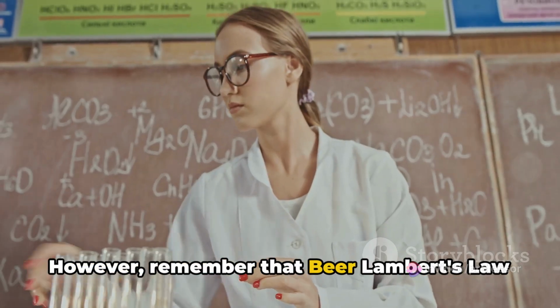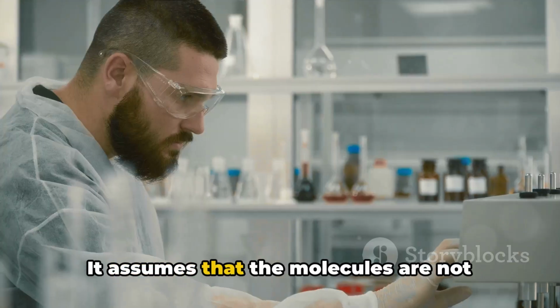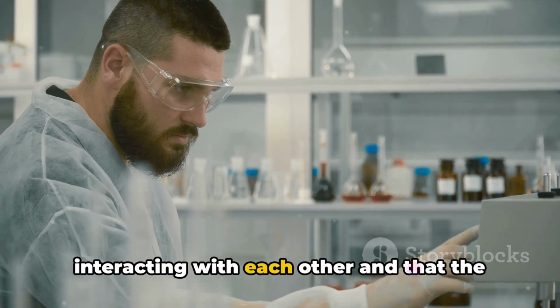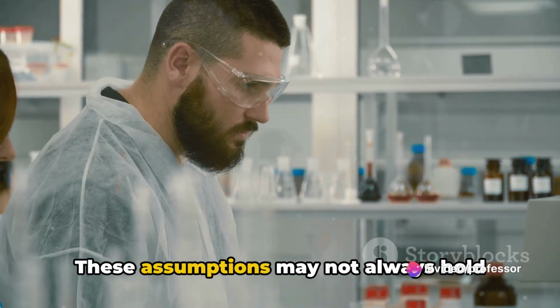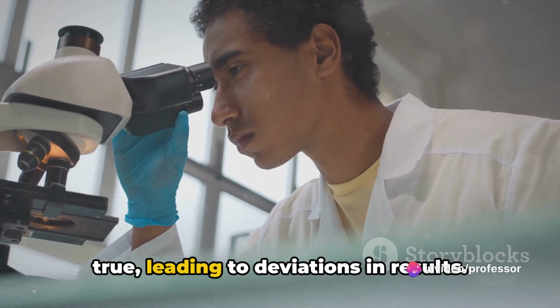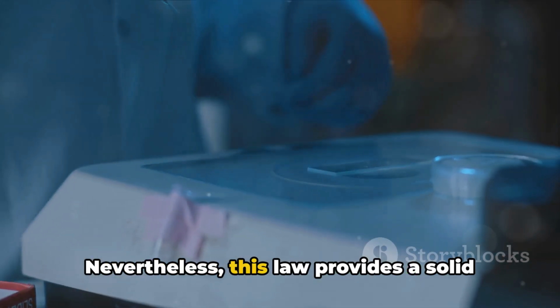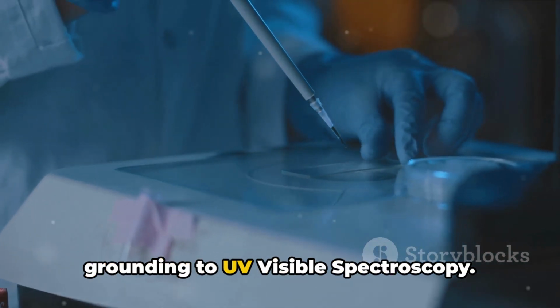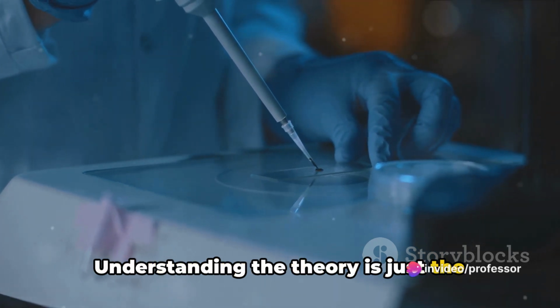However, remember that Beer-Lambert's law is not without its limitations. It assumes that the molecules are not interacting with each other and that the environment is constant. These assumptions may not always hold true, leading to deviations in results. Nevertheless, this law provides a solid grounding to UV visible spectroscopy. Understanding the theory is just the beginning.